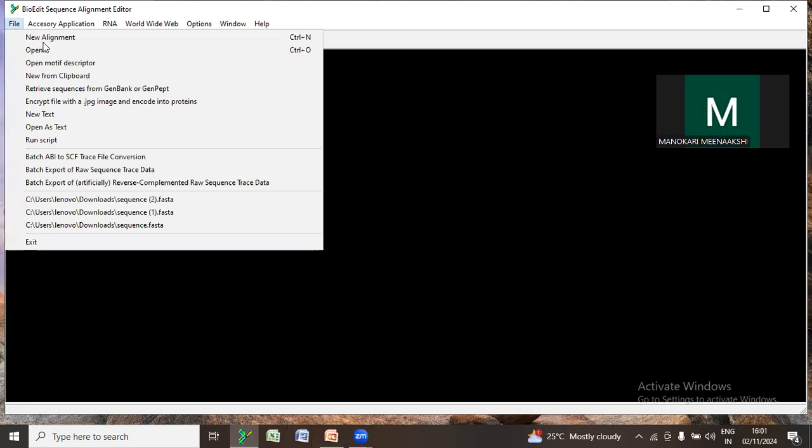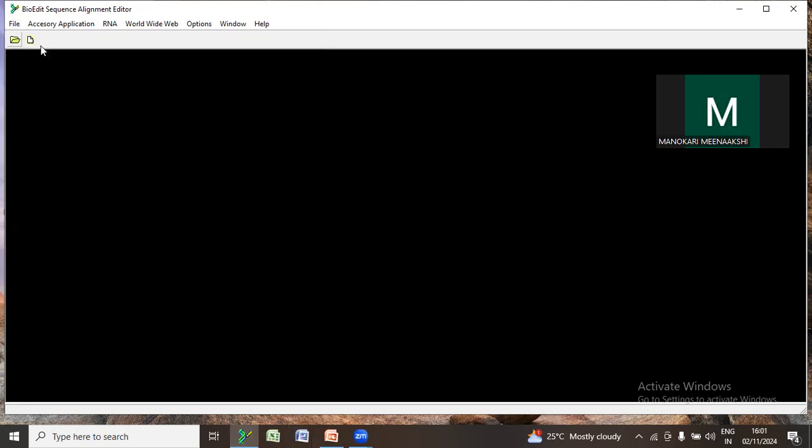Now, what you are going to do is load your sequence. First, go to File, go to Open. It is loading.